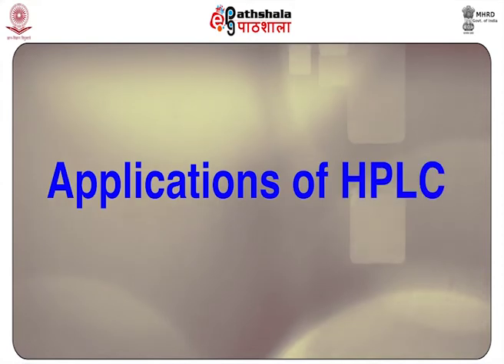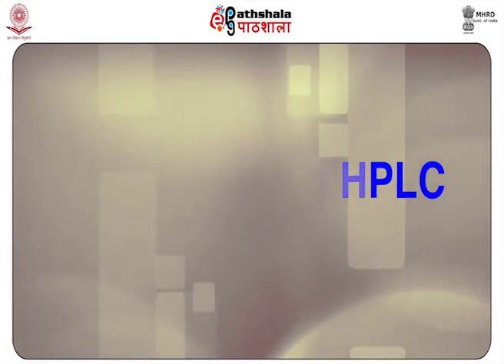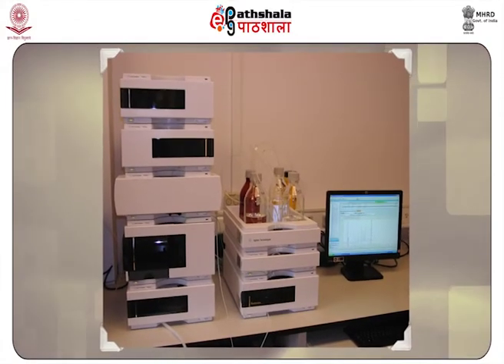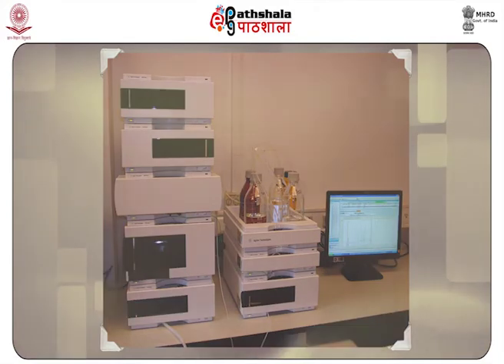Now, the applications of HPLC. High performance liquid chromatography is an important forensic technique often used in cases involving drug trafficking. It is used in detecting performance enhancing drugs from urine samples and separating the components of different biological samples.